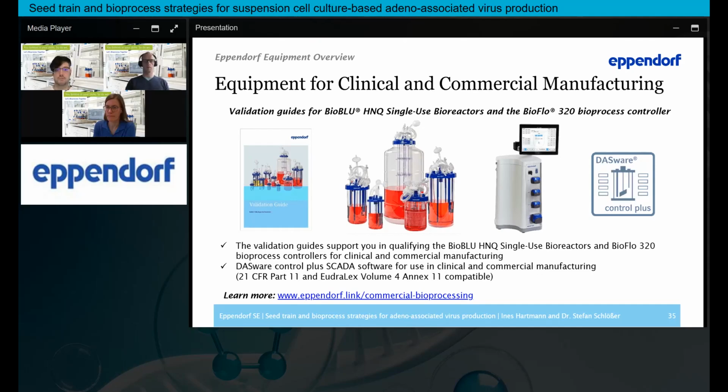A glass one is reusable, which can also be in certain cases an advantage, but you need to have a cleaning procedure worked out, which can be a lot of work and can also come with insecurities depending on what is needed for your bioreactor. So in general, single use is gaining traction in the field of cell and gene therapy in recent years.